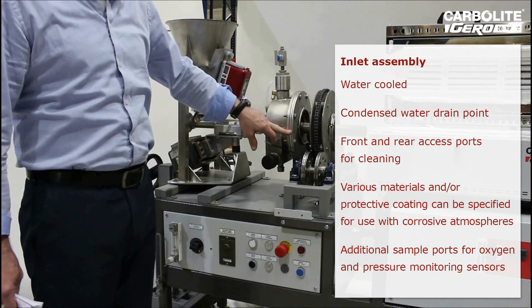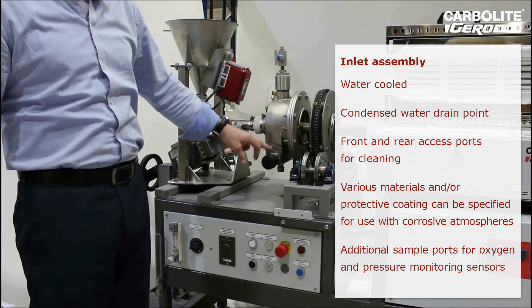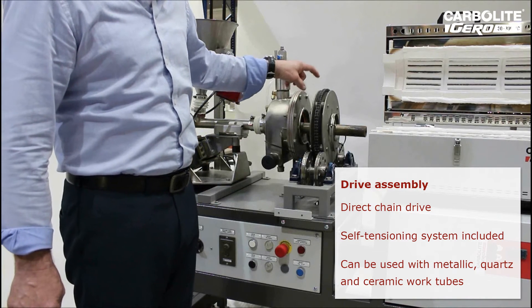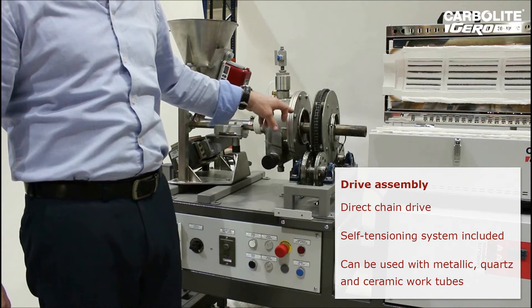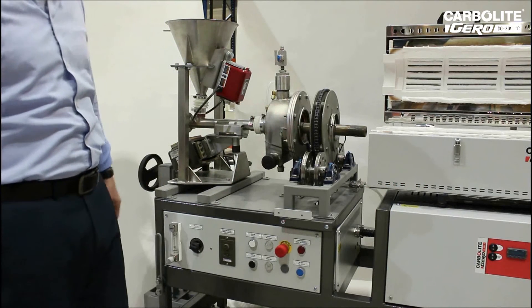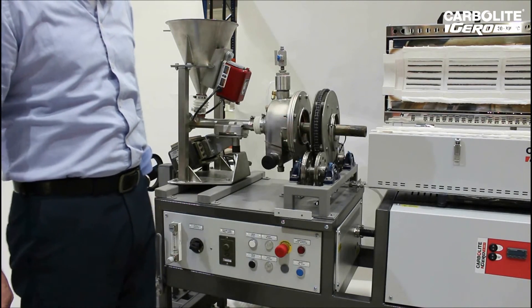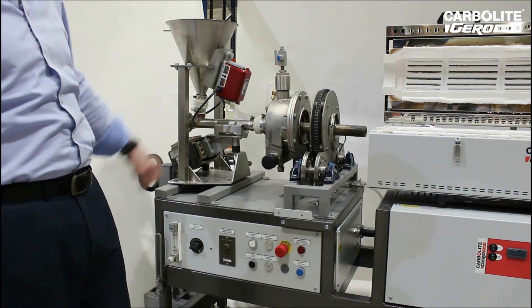Twin silicon rubber seals and exhaust vents and collection traps. The drive system uses two wheel support with a direct mechanical drive through a simple Panasonic drive motor. All these features can be changed to suit specific customer requirements, such as an inverter drive or a screw feeder to replace the vibratory feeder.